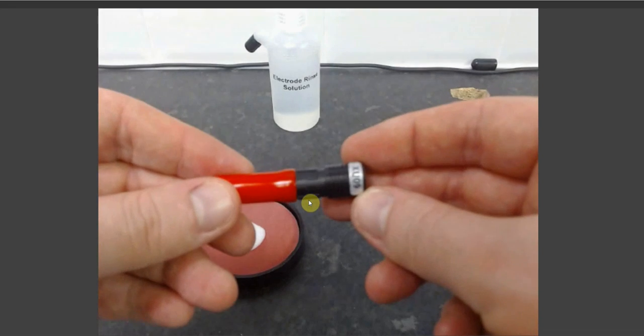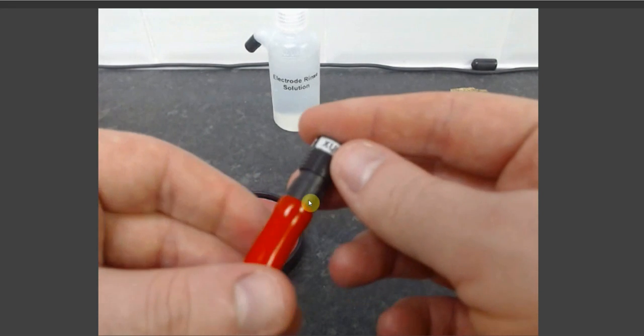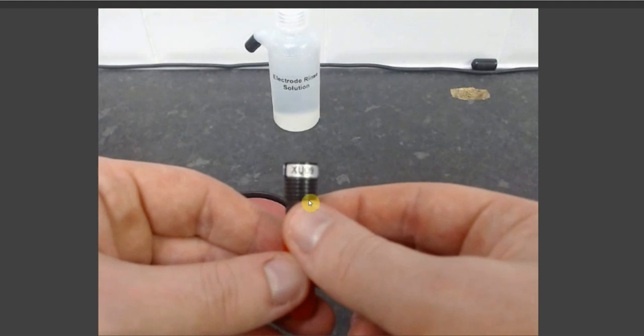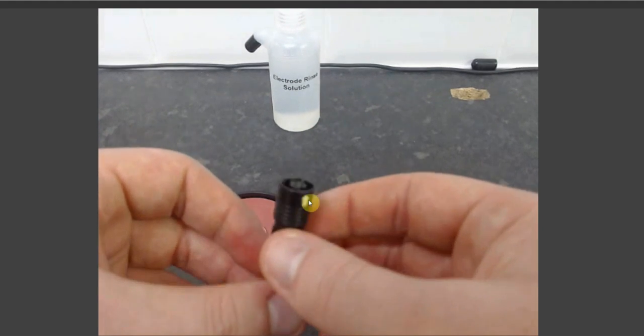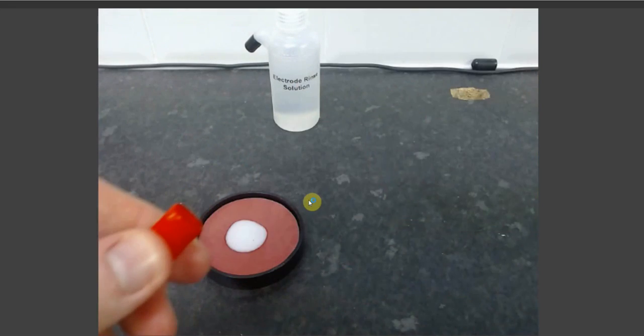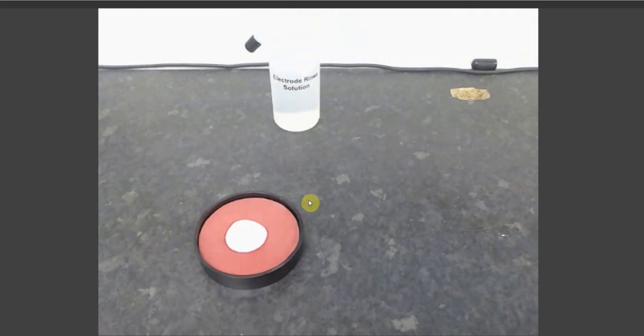Take your working electrode. For parameters that require a gold conditioning solution, this will be a WE2 electrode, and for those that require a mercury plate solution, it will be a WE1 electrode. In this particular case, we have a WE2 electrode, though for polishing the process for both is the same.